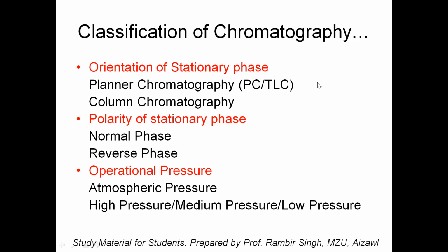So on silica, we need to use organic solvents, but for proteins, we cannot use organic solvents. That was a very tricky situation when we were working with normal phase chromatography. For a chemist, normal phase chromatography is very good because in chemistry, we do not use water as a solvent for doing any kind of reactions. We use all dry solvents, right? So what we did actually, there was a tricky situation: I want to use water as a mobile phase for biological samples.